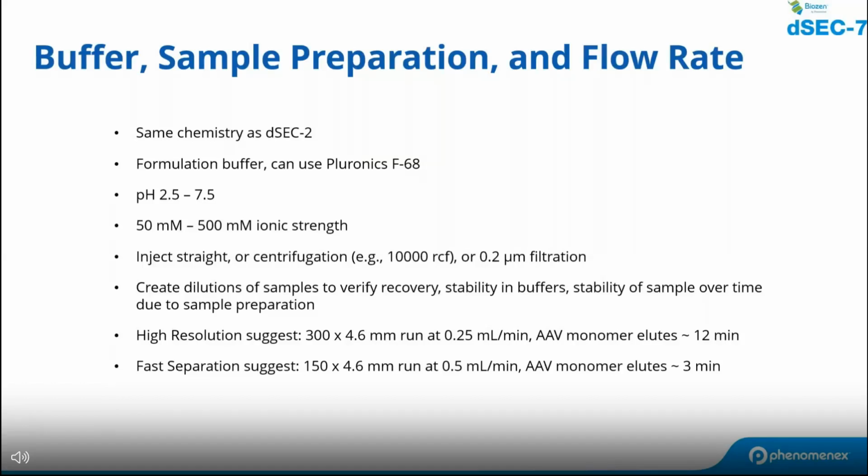Now, note that the LC itself, the column itself with the detector, actually has really good precision. Meaning, typically, if you inject something, it gets to the system, you only have maybe an RSD of 2%. So you can actually utilize the accuracy and precision of the LC to help you establish a very robust and reproducible sample preparation method.